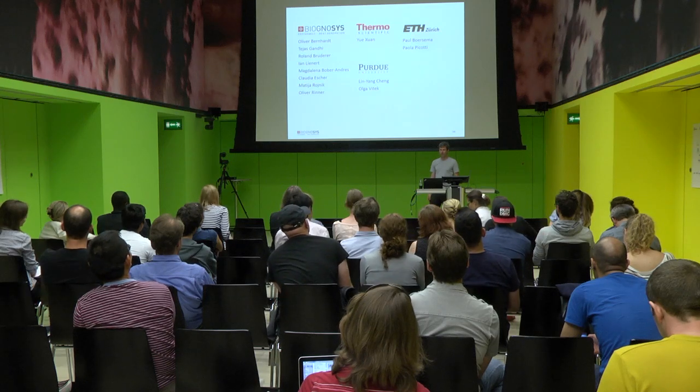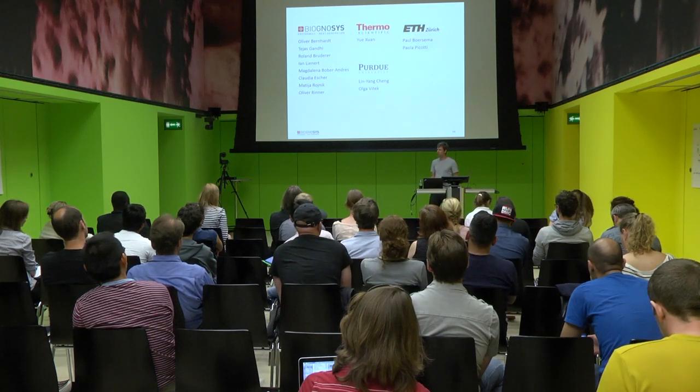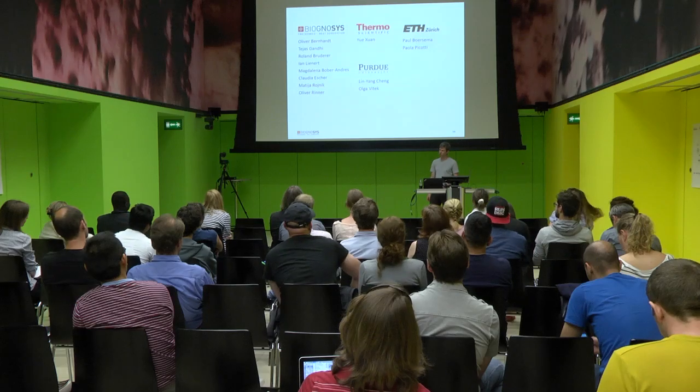Well, at the moment, for instance, what we don't do is this DIA-Umpire approach, so that you wouldn't need a spectral library, but you would do basically a database search of your DIA data. You can, in principle, do it also. You can just feed in a spectral library that is derived from a FASTA file, because Spectronaut doesn't need any iRT or anything else. You can just feed it the precursor m/z and fragment m/z. And we have also tried that, I have to say. So it works, it just doesn't work as well as with a spectral library. So that's why we stick to a spectral library at the moment.